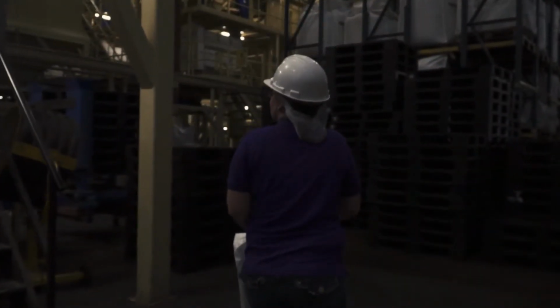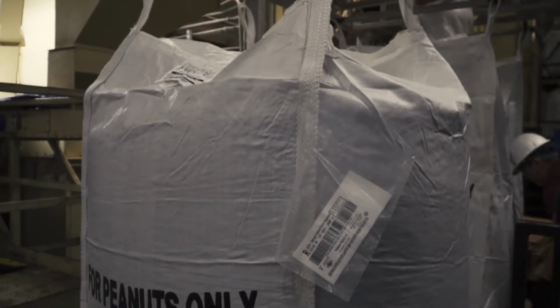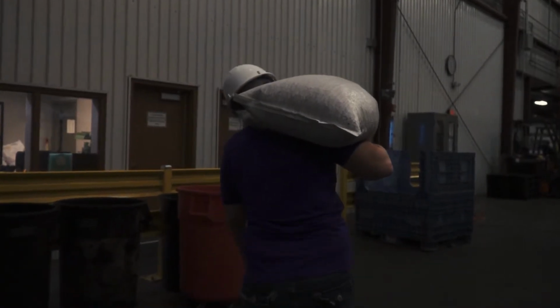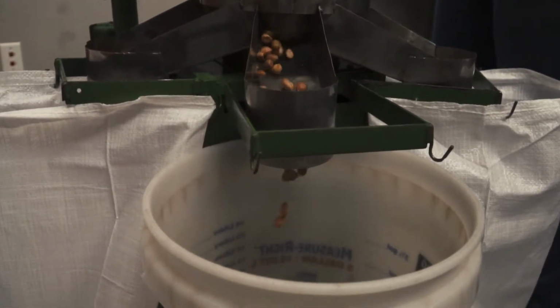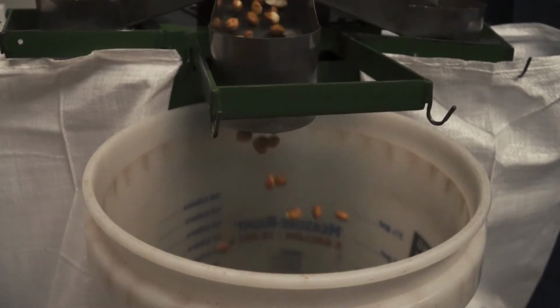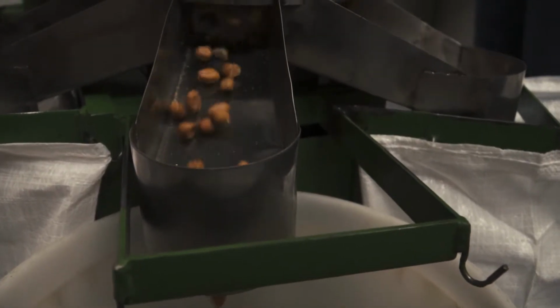Throughout its production, the lot is continuously auto-sampled. Approximately 100 samples are taken from a standard 44,000 pound lot, resulting in a total sample size of about 160 pounds. An FSIS employee collects the samples throughout the lot's production and pours each into the divider, separating them into 3 48-pound bags for aflatoxin analysis and 1 16-pound grade sample used by FSIS to create the lot's official grade certificate. It's crucial that positive lot identification, or PLI, is maintained throughout the sampling and packaging process.